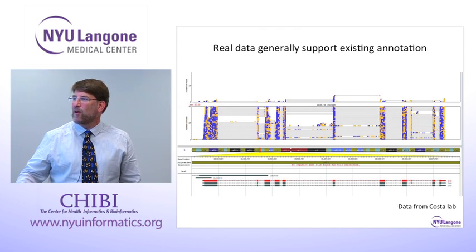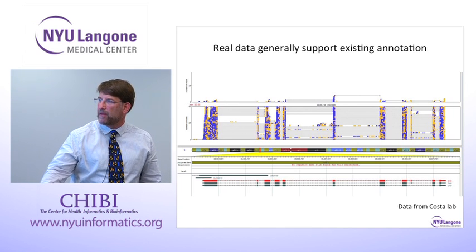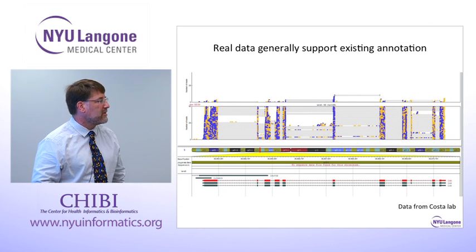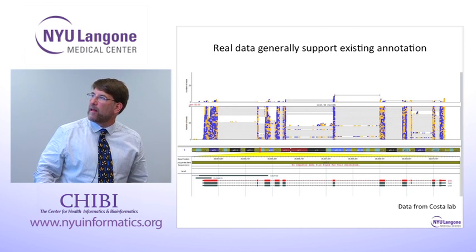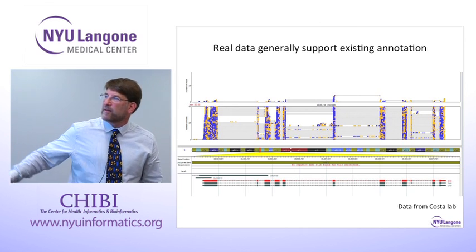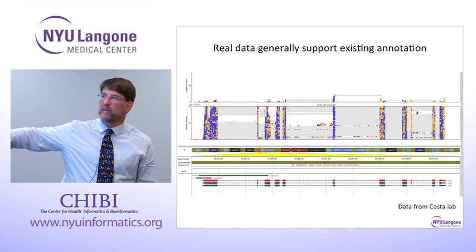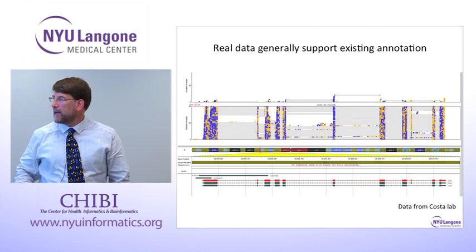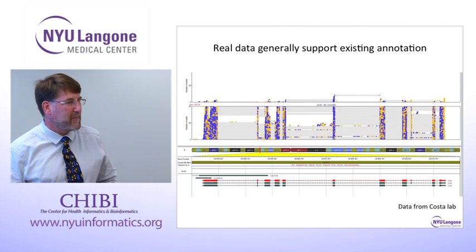So all the ones that don't map mostly go away. But we always see a few reads that map onto intron positions. So this is a very typical look of an RNA-seq project. This one is also showing you differential expression of this gene between 2 samples, which I will get to in a minute. And I have to credit this data comes from the Costa lab.